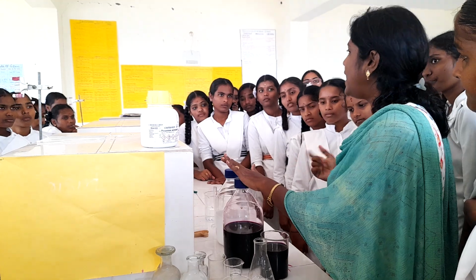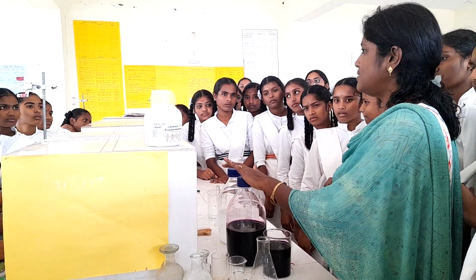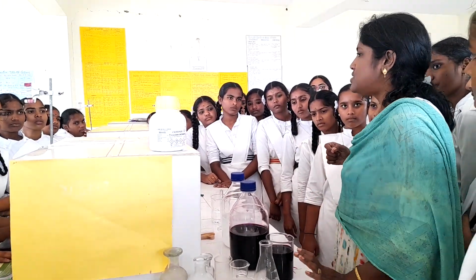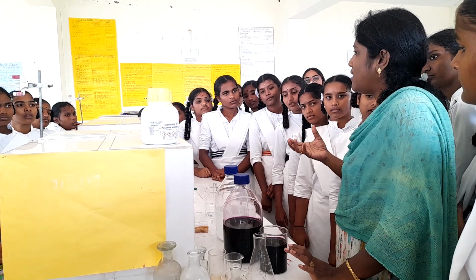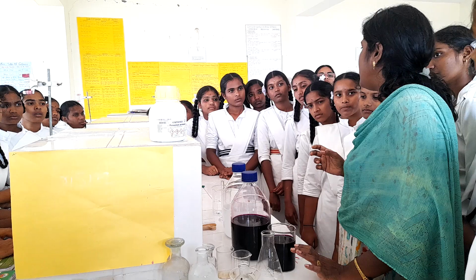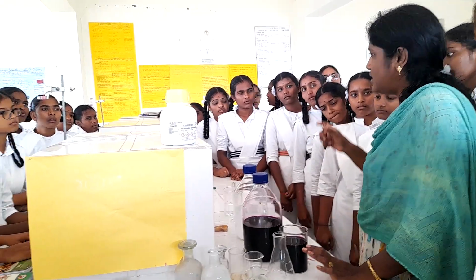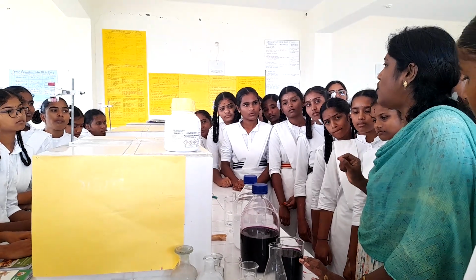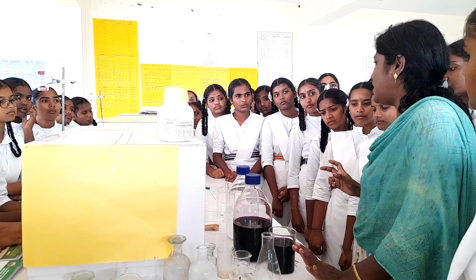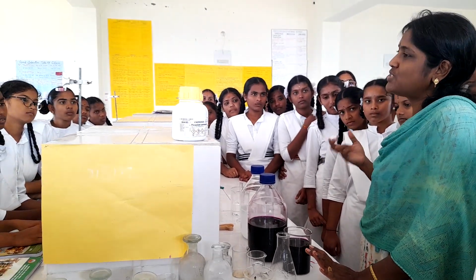So what could be the end point? Can anyone guess it? Actually, it will be colorless. As soon as the titration starts, it turns pink. So immediately you get mistaken that you got your end point at 1 ml or 2 ml itself. But it is not, because that pink color you get by the addition of 1 ml or 2 ml is not going to sustain for more than 1 minute. Immediately it is going to disappear. So instantly it appears pink, but after some time it disappears.